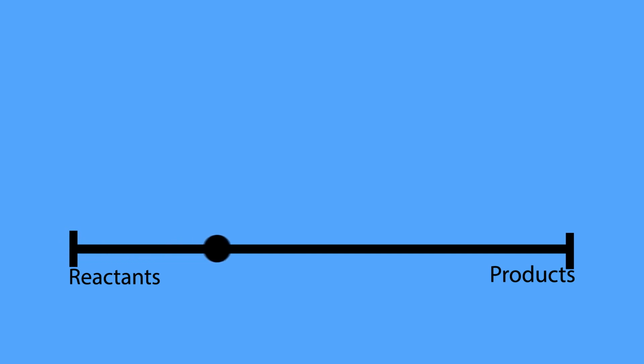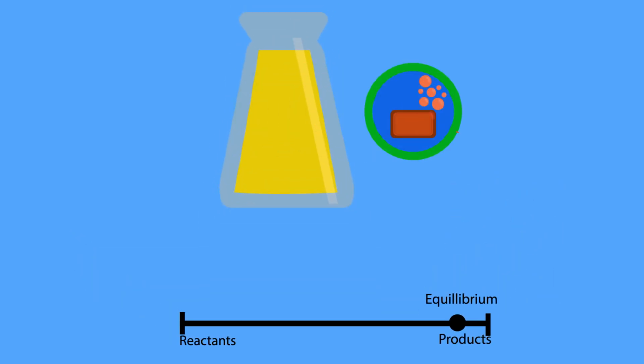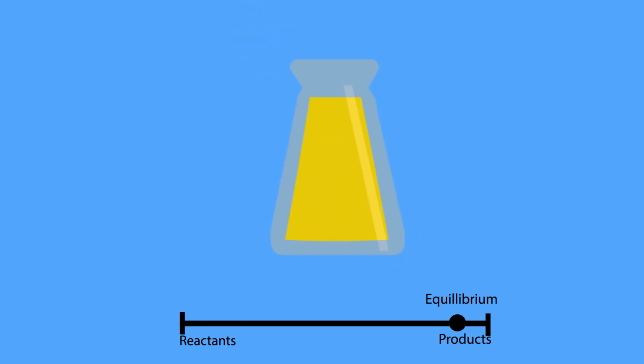The transesterification reaction will proceed quickly at first and eventually slow down as it reaches equilibrium. At this point, there will be some unreacted glycerides left in the biodiesel. It is possible to improve the quality by removing the glycerin that has settled out and to run another reaction, thus pushing the equilibrium point farther to the product side. For this lab, 1 reaction should be enough to get a good separation of the glycerin from the biodiesel.